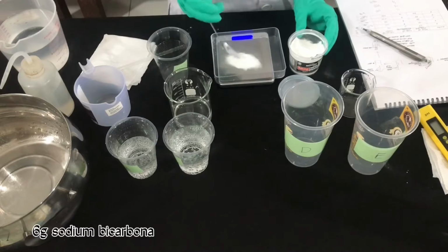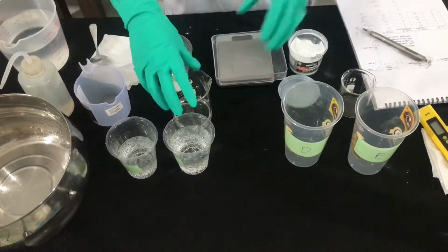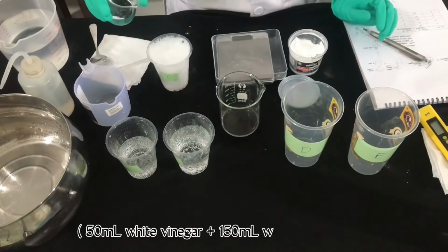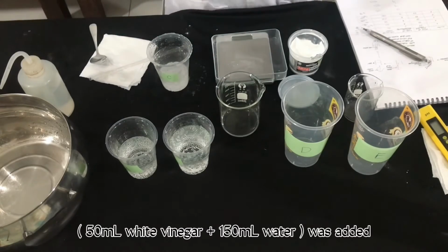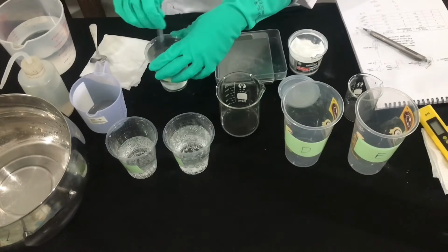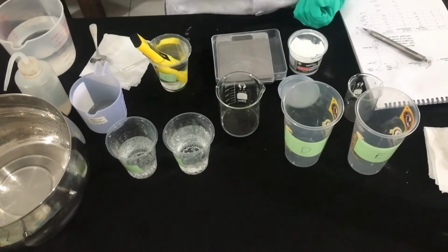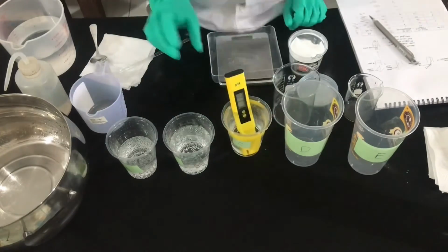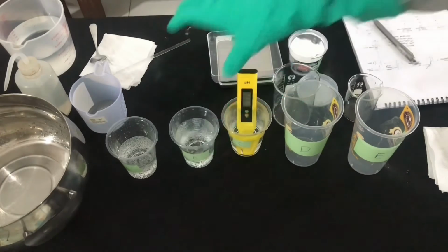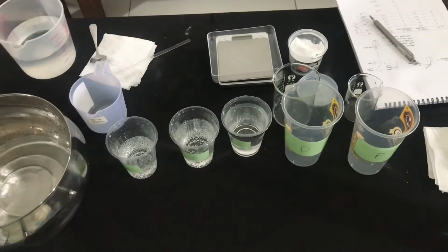For cup C, 6 grams of sodium bicarbonate was weighed and transferred into the cup. Second, 50 ml of 0.83 molar white vinegar and 150 ml water was added. The solution in cup C was stirred until all the sodium bicarbonate was dissolved. The pH value was measured and I get 7.14. I already get the neutral pH value from cup C. Next, I just proceed to measure the pH value for another 2 cups.